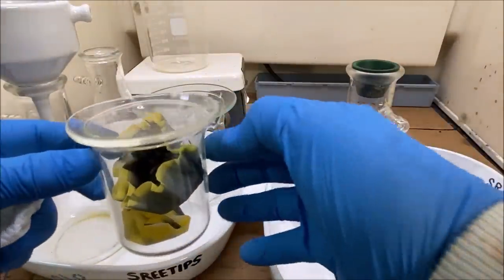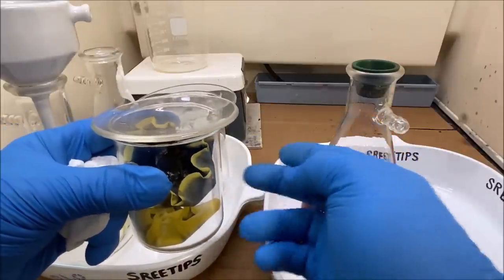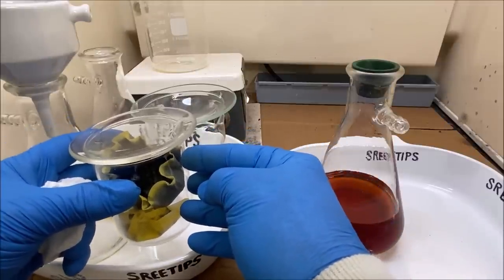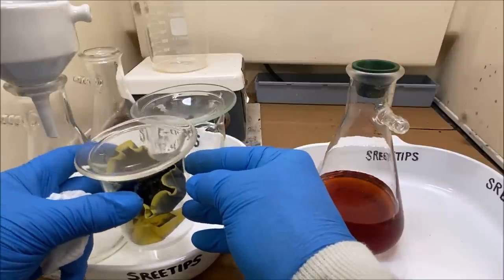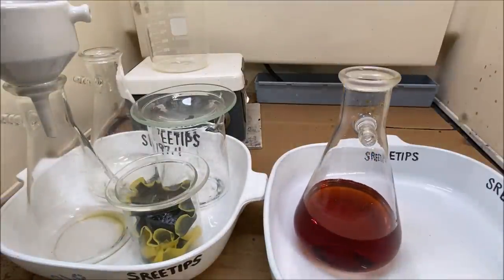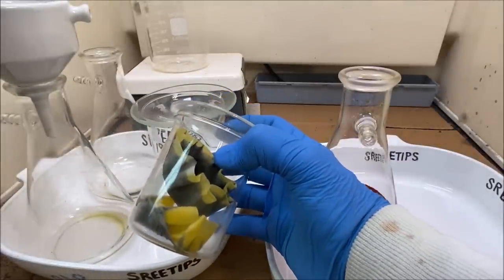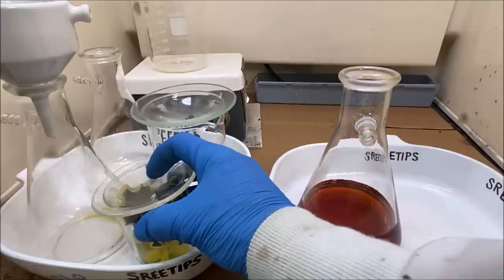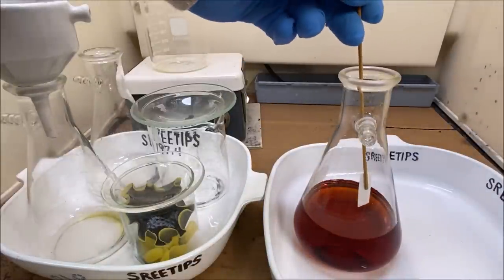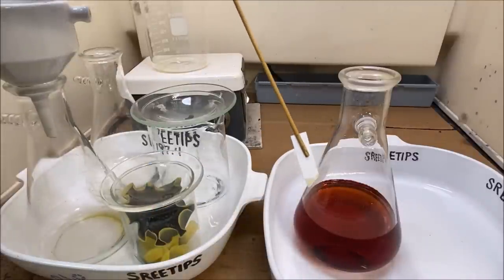If I do that, and this turns out to be iridium, then what would happen is small quantities of the iridium would go into solution from the hot aqua regia. I know it's not supposed to dissolve iridium, but small quantities of it will go into solution, and then we'll just end up adding it into our platinum solution and creating more contamination. The second alternative is to just take this material that's in these filters, put it in a crucible, and melt it up into a little bead, and then send it into their big refiner and have them shoot it with their XRF and see what we've got here in the way of metal.